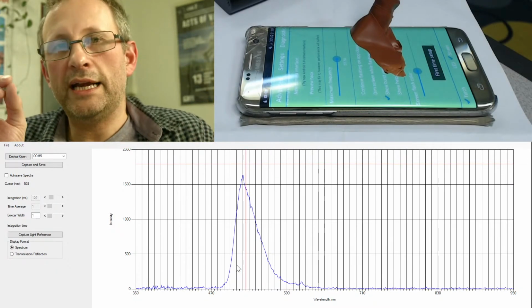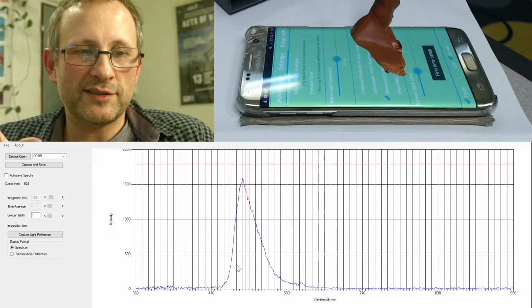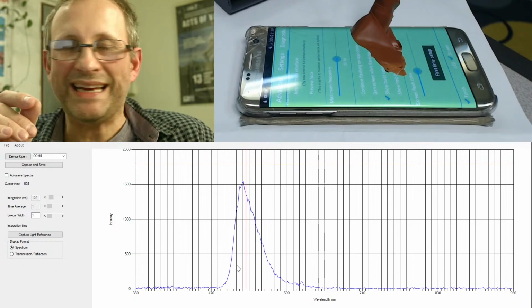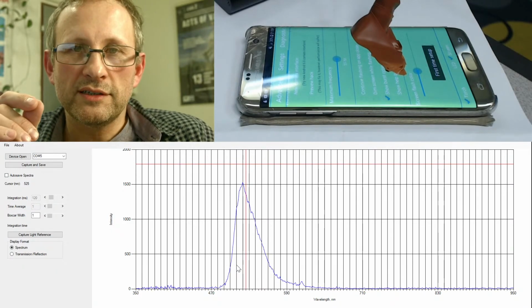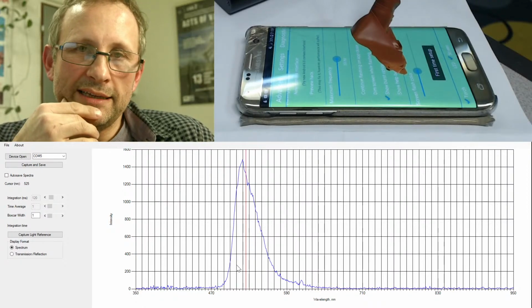So in the supernova reactor, I would be looking out to see this production of a green output, maybe for the production of aluminium, which shouldn't really be in any of the reactants.